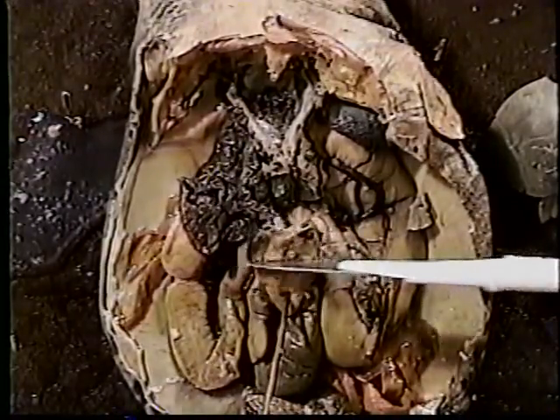Now let's see if we can actually take apart the different sections of the heart. First, I will cut diagonally and separate the auricles from the ventricle. This is complicated and does not always work.